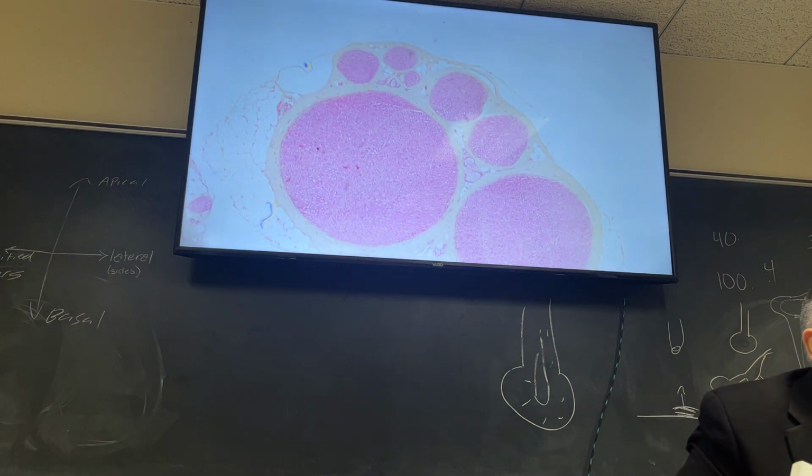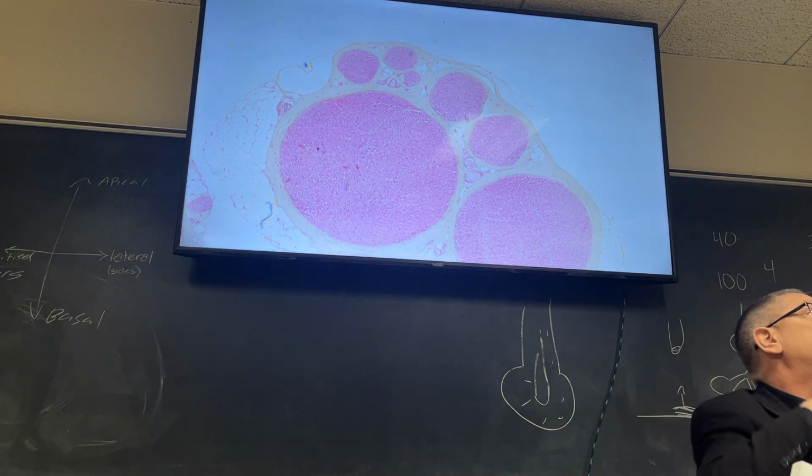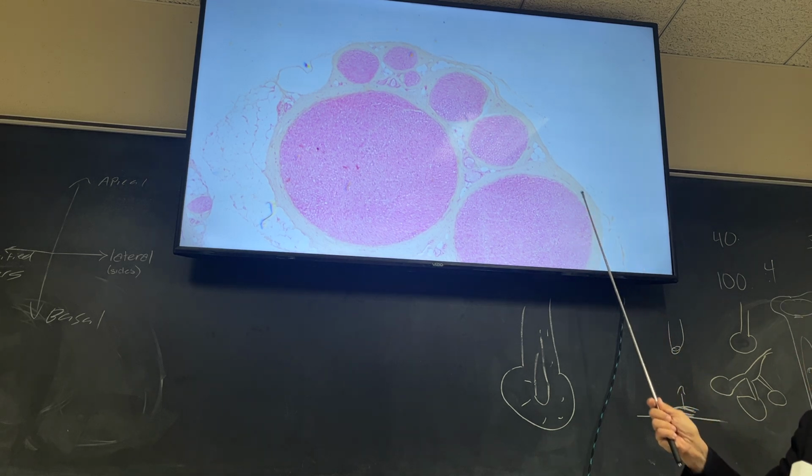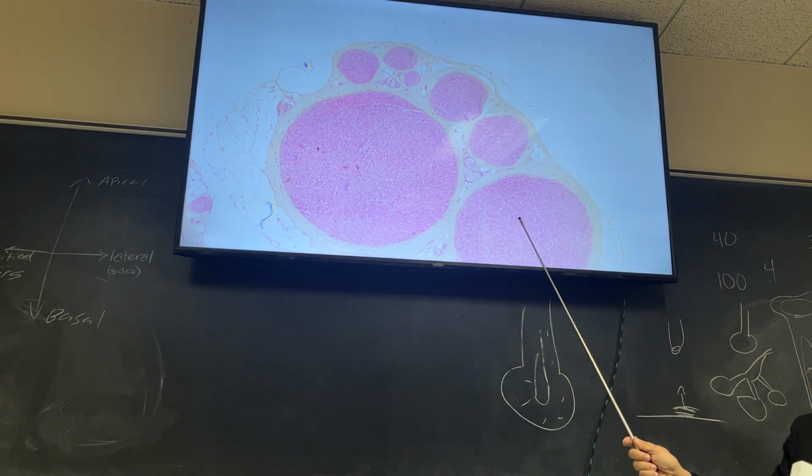And this is where you can see the layers really well. Actually, it's not muscle, it's nerve, so it's neurium. Same difference, right? You've got the same three layers here: epi, peri, and endoneurium, instead of mysium. Epineurium, perineurium, and endoneurium. Same three layers. So, epi, peri, endo, right?